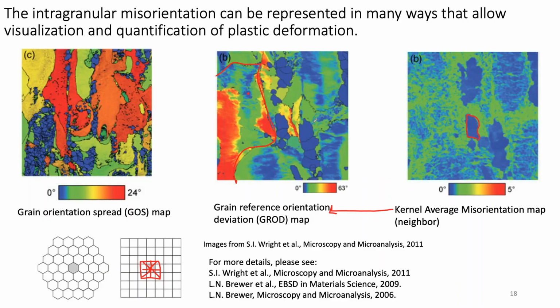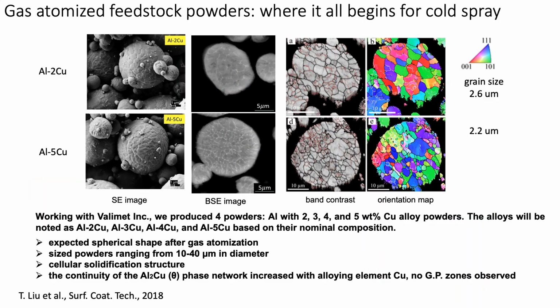That's also true for these particles here. We use a special epoxy when doing this, but we basically mix powder into epoxy, cast it into a mold and then do mechanical metallography. Again, that vibratory polishing with, say, colloidal silica is a key final step. But that seems to work fine.